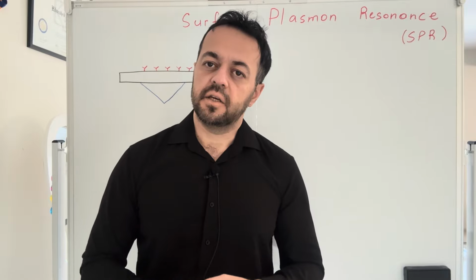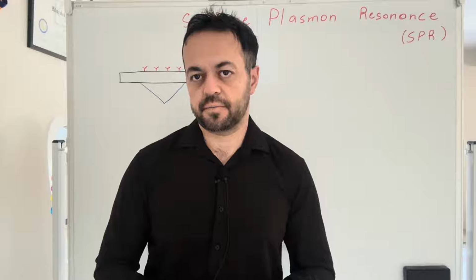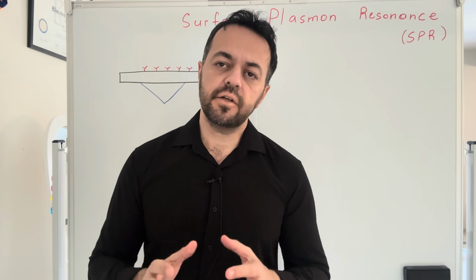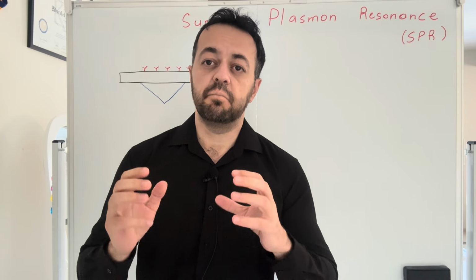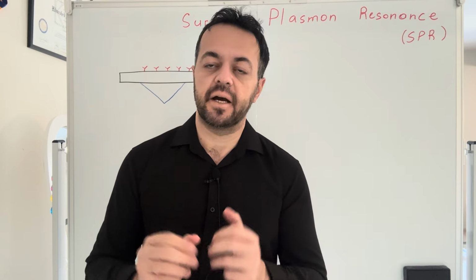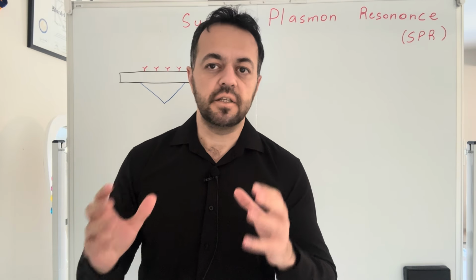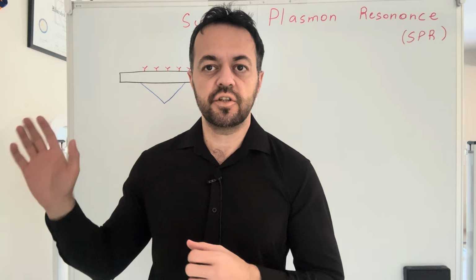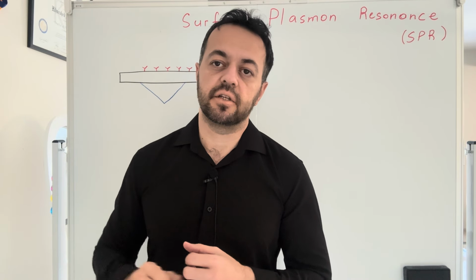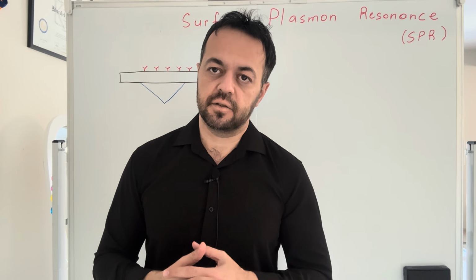Hello everyone. In this video, I'll talk about surface plasmon resonance. But before shifting to the actual mechanism of SPR, I really want to briefly overview the plasmon and what it actually means. Once you understand this plasmon, then it's easier to grasp the actual meaning of the SPR, its structure, and its purpose. So let's go ahead and get started.